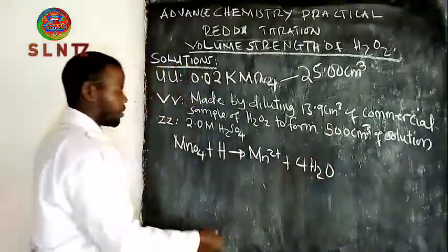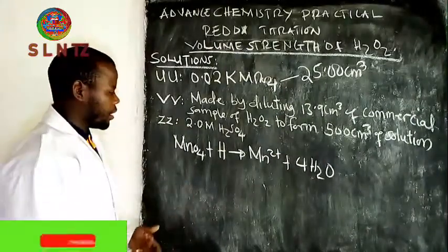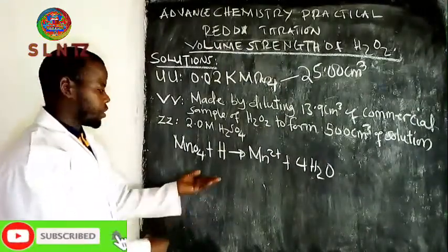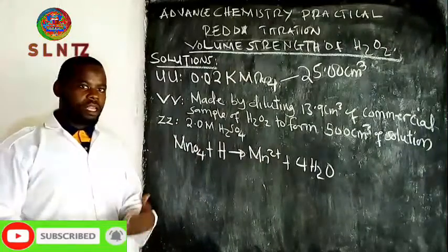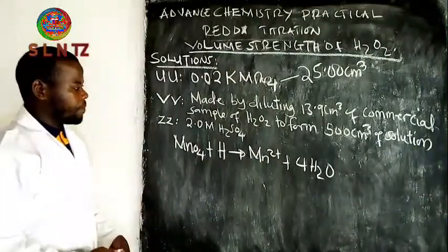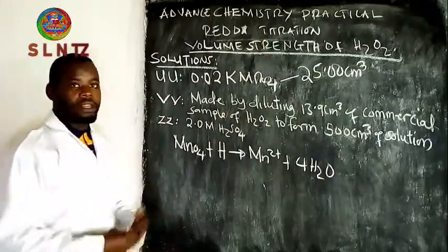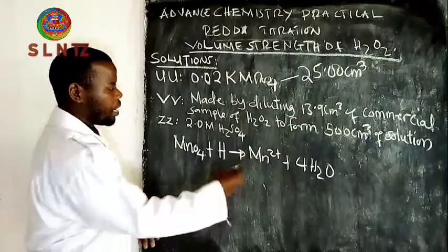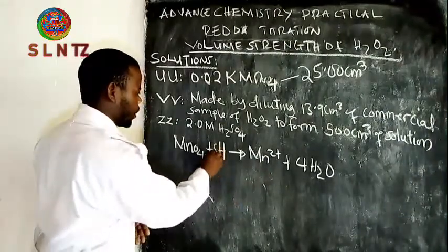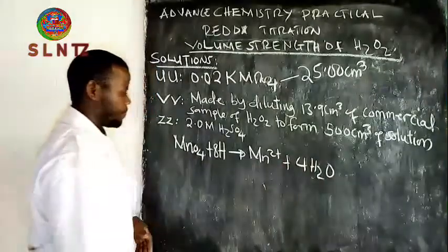I put it directly and go fast in order to be together. I think in the previous lesson I described this, so you can find that lesson and then understand more about the reaction. When you balance here there is 8, and here there is.